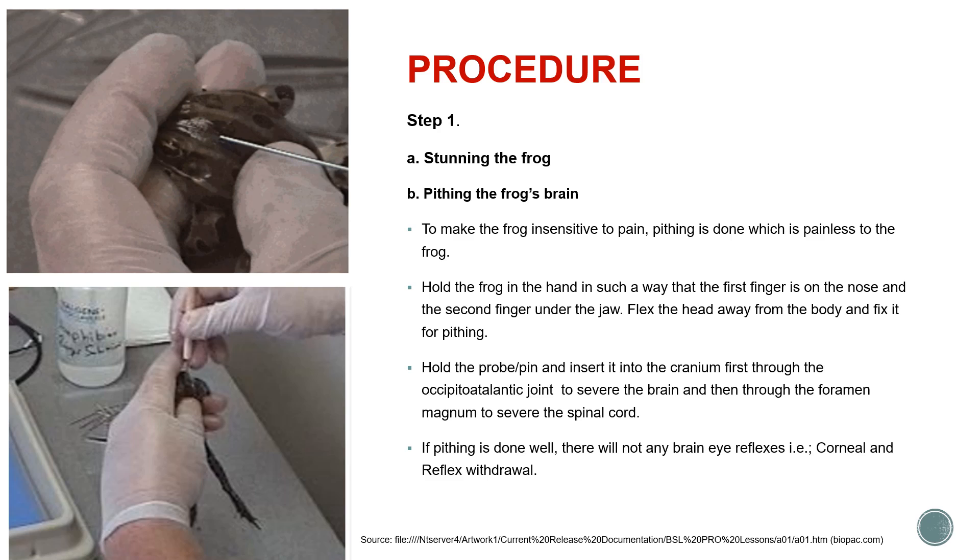After stunning the frog, we need to do the pitting of the frog's brain to make it insensitive to pain. Hold the frog such that your first finger is on the nose, the second finger is under the jaw, and you are flexing the head of the frog away from the body. Fix it firmly — you must not allow the frog to move. Already because of stunning it will be immotile and you can flex the head very easily.